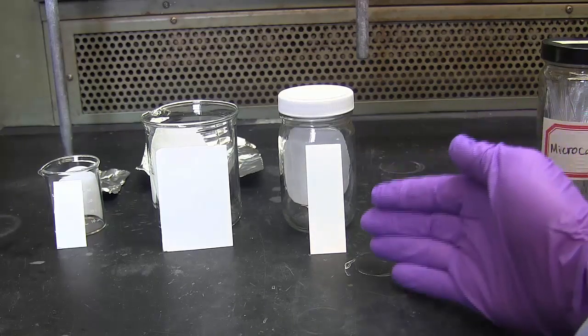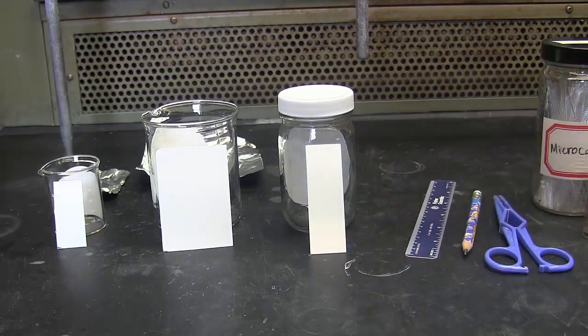And then you have a standard plate on the right-hand side that can be used quite nicely in a jar.